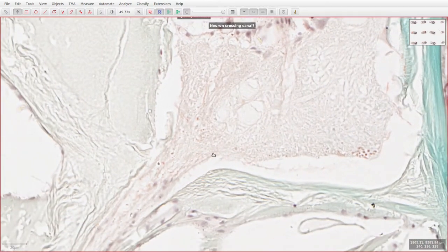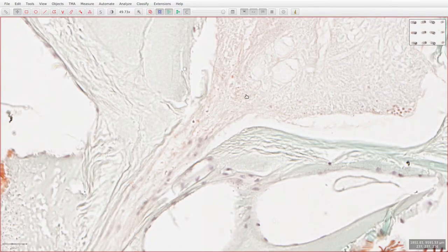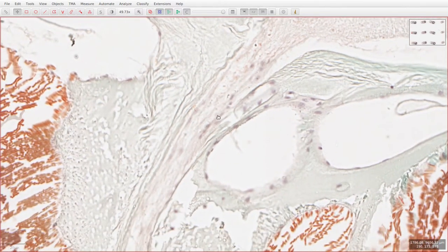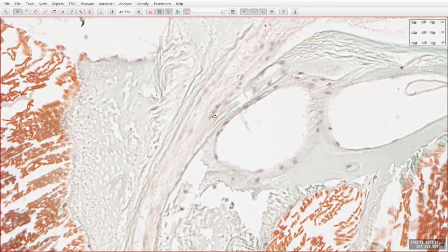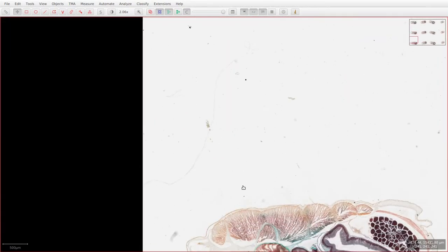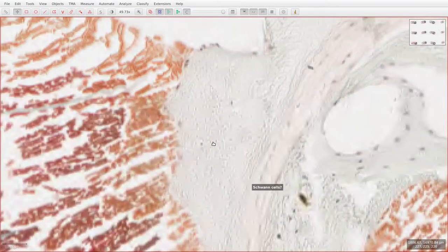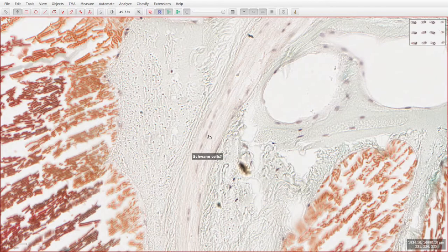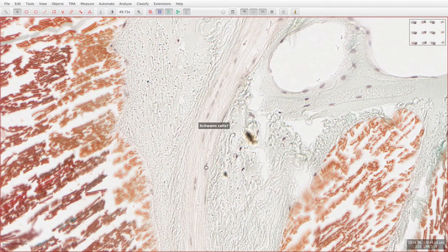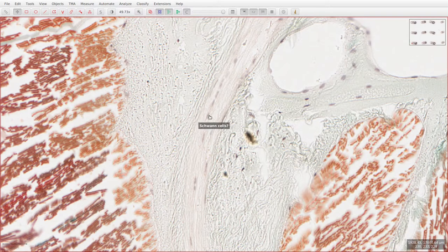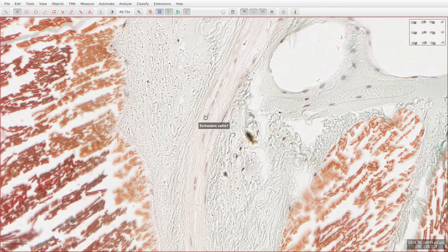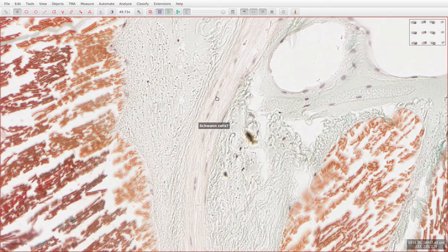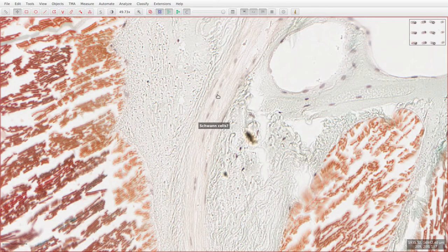If we look now at the peripheral nervous system, we have a nerve branching off from the dorsal spinal cord, and within this nerve we can start to see nuclei. It's much clearer if we go down to this section down here. So we can see lines of cell nuclei coming along this nerve, and these are thought to be similar to the Schwann cells in vertebrates which are there to myelinate the peripheral nervous system. But the peripheral nerves in amphioxus are not myelinated, so these cells will just be providing some kind of support system.